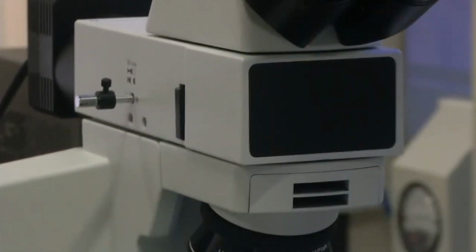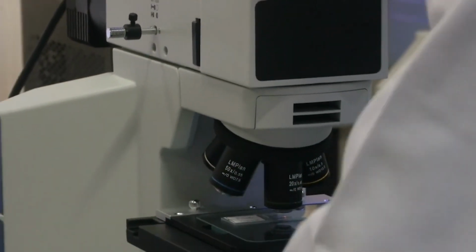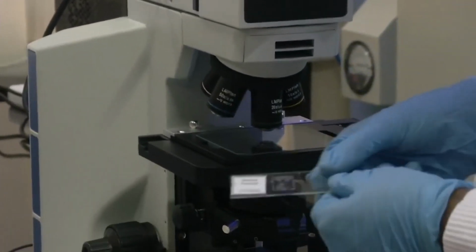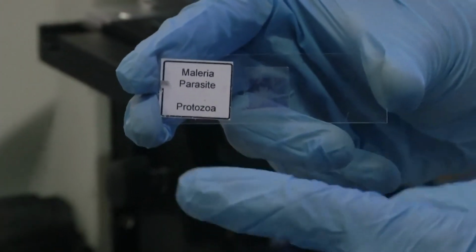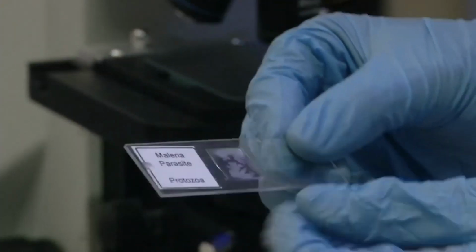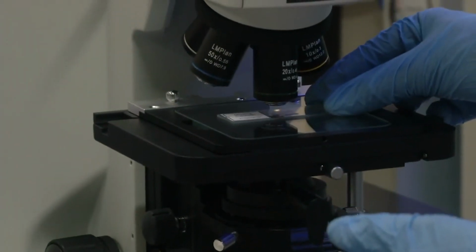Today, I have taken one sample from here, and that is inactivated malarial parasite, because all of you are aware of malaria disease. So, I thought we will show you the malarial parasite. This is inactivated, nothing to worry about, you will not get any disease with this, but you have to always take precautions because you are handling biology related topics.